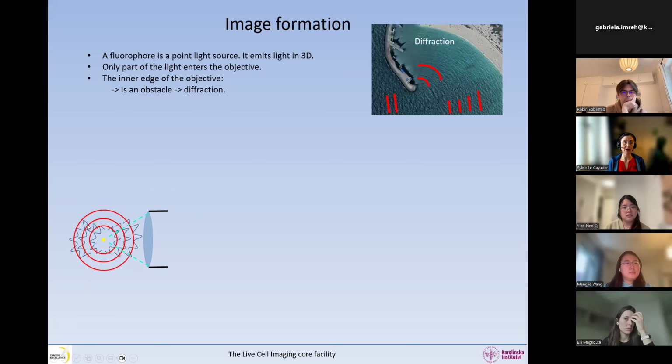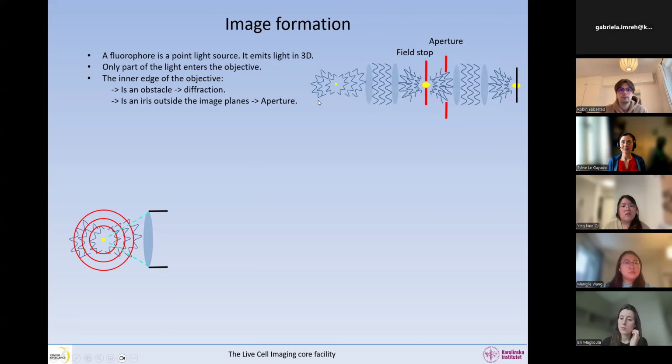So I remind you that when light encounters an edge, the wavefront is bent. And this was the whole train that I was showing you. So this is our little point source. The wavefront is changed, and we now get a parallel, flat wavefront, and then we can do that again, and we have an intermediate image, and then we end up with the final image which we record.